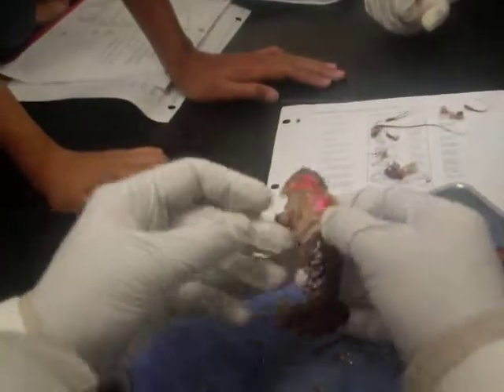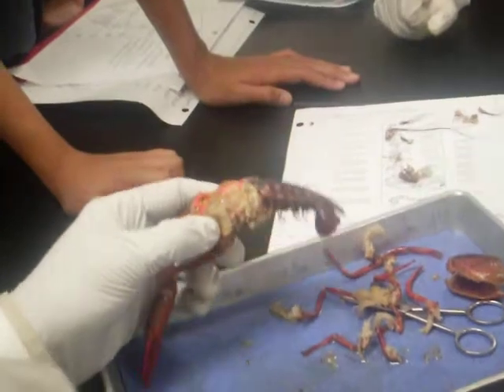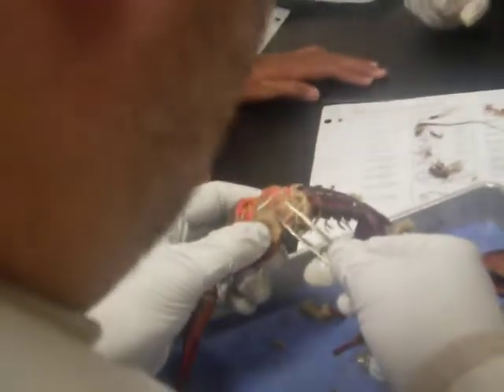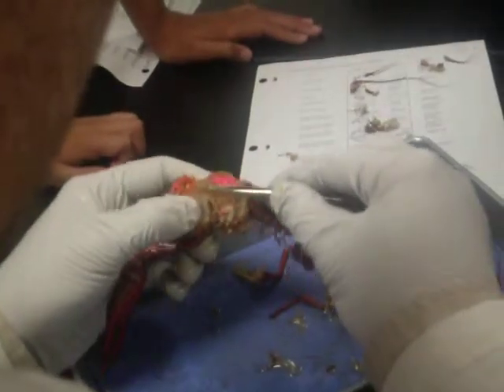Now, what we have here — see this hard, kind of plasticky covering? Pericardium. You're going to see it on the frog, you're going to see it on the pig. It's what covers our heart basically. This is more plasticky, but with us it's very much like a sack to protect our heart.